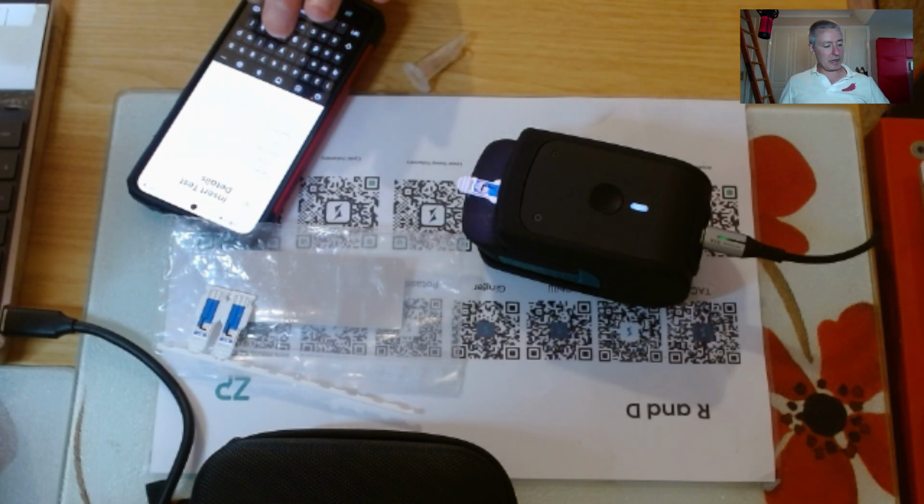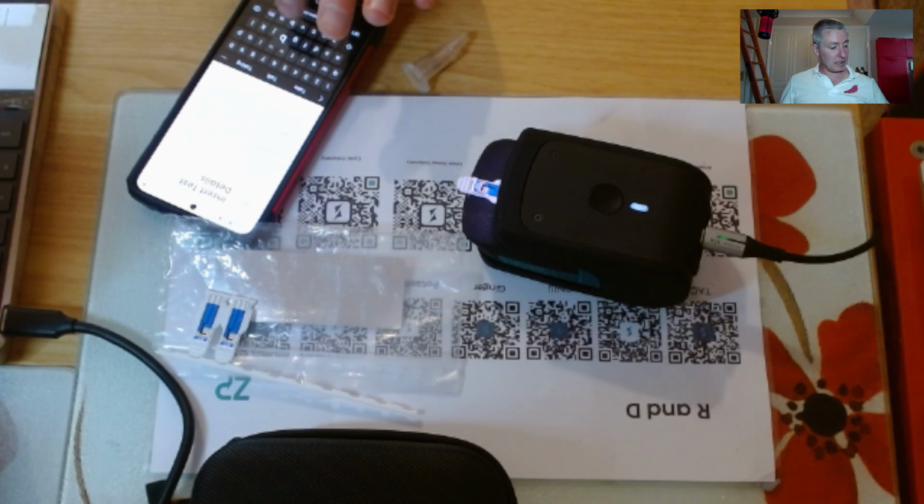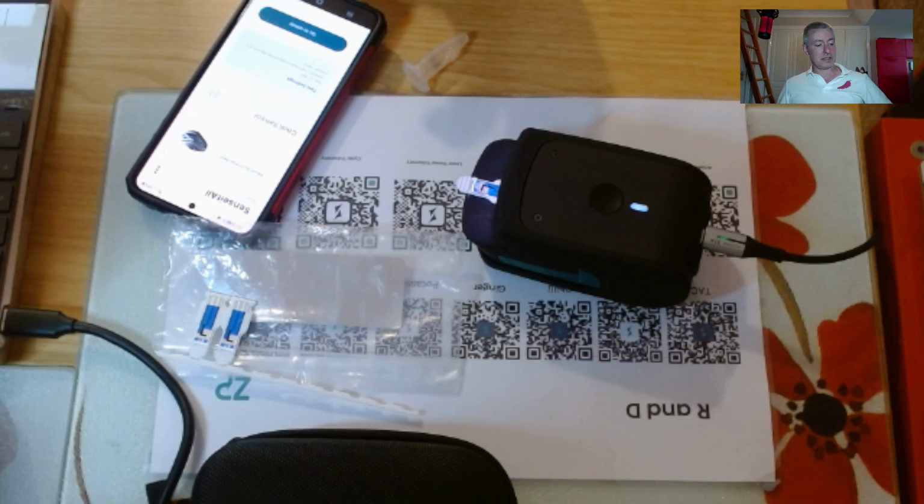Just give this a quick name. Tab. Sorry, I'm just thinking whilst typing, and that's not necessarily a good thing. Go to assay and start measurement.